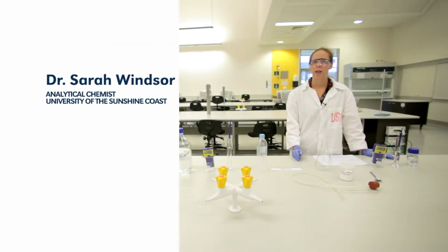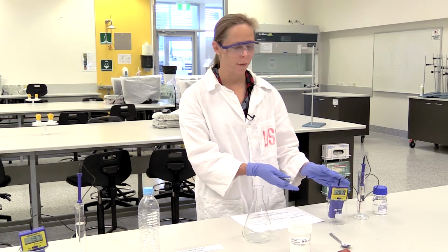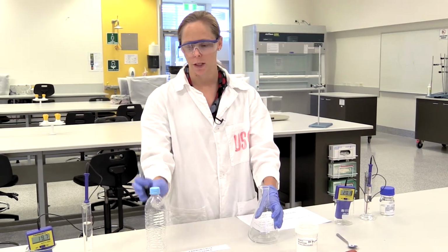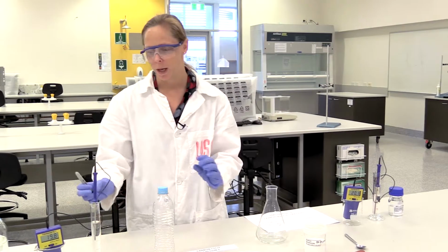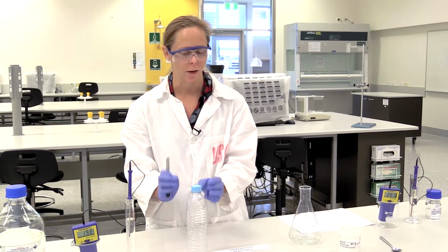So this time we're doing a carbon sequestration experiment. So the same format again, we're adding our acetic acid and sodium bicarbonate in this reaction vessel here, and then we're transferring the carbon dioxide into this bottle over here. But what we're trying to do is actually sequester carbon, so then we'll be adding sodium hydroxide to this bottle and seeing if we can sequester the carbon dioxide.